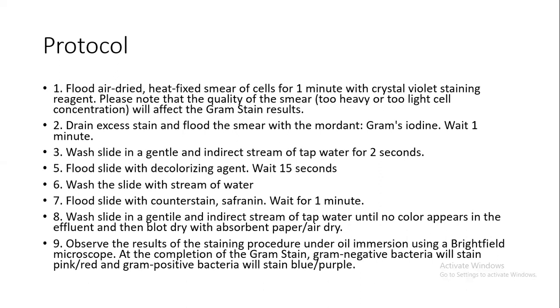After which we wash the slide under a gentle stream of tap water. And then we perform decolorization using decolorizing agents such as alcohol for about 15 seconds. The slide is again washed under a stream of water and counterstained with safranin for 1 minute.